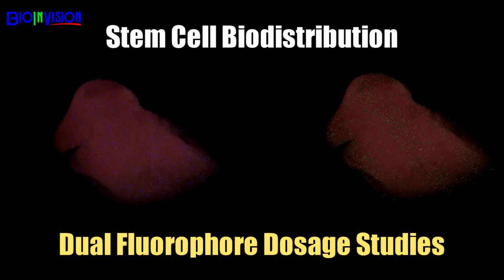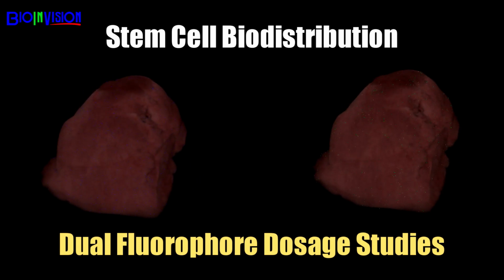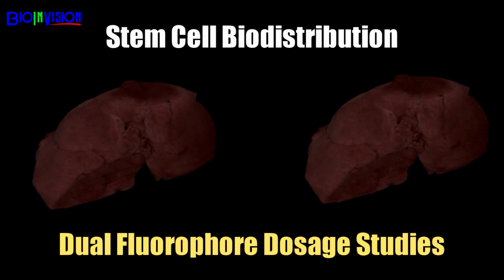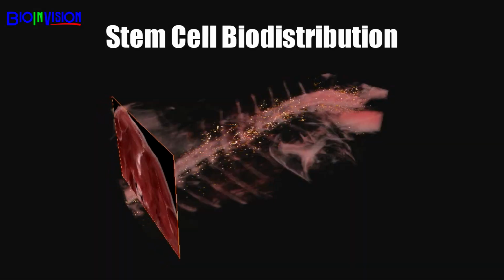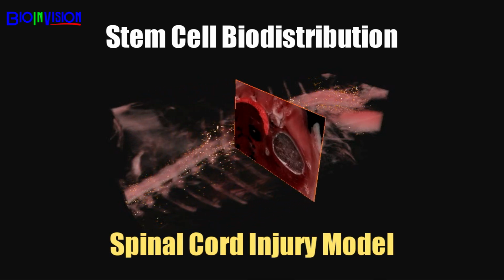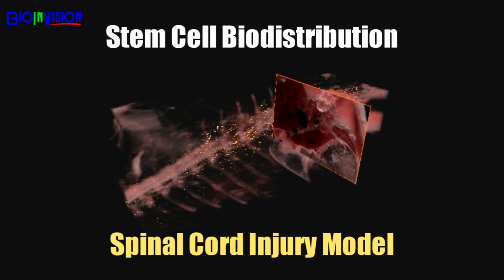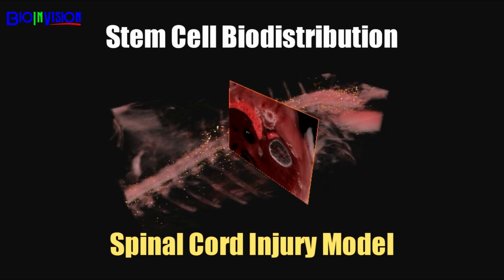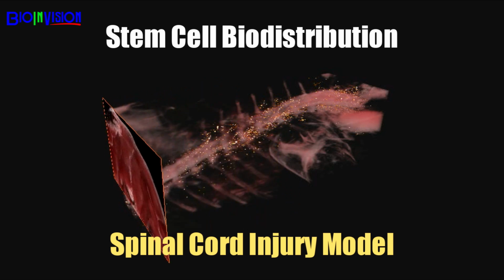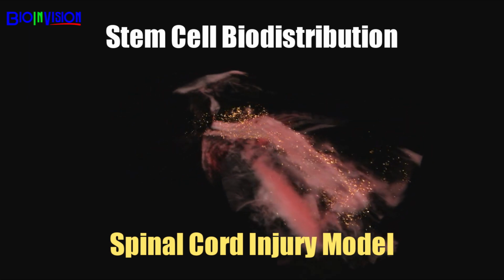In fact, let me put that cost into perspective for you. If you stop and think about the type of research we touched on today, it might employ genetically engineered mice that cost tens of thousands of dollars each and costly reagents. But that's all because they help to execute better, narrower investigations, right? Wouldn't it make sense then, after such sizable investments, to spend just a small fraction more in order to utilize a technology that makes possible the greatest level of learning from imaging?